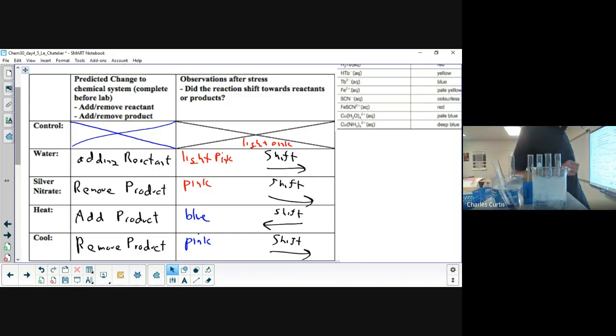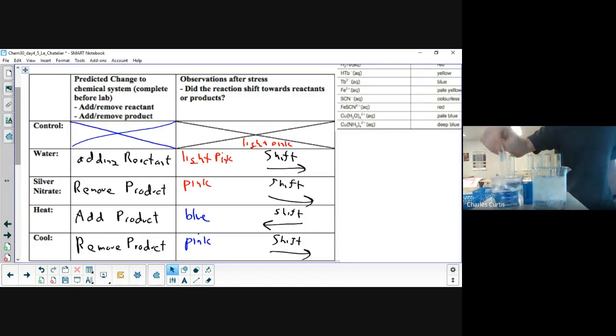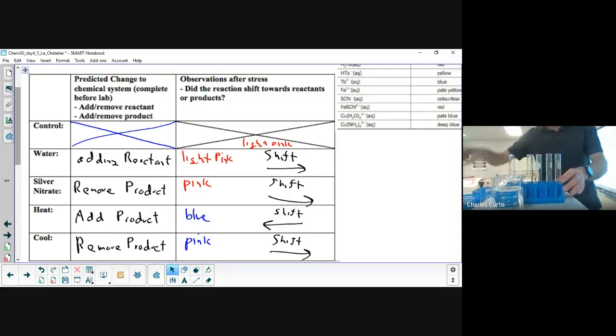Now, while I was writing that down, I threw this test tube back in the hot water. We don't need to record this again, but we're seeing it turn blue. I could go back and forth over and over again, and this would keep changing color. Blue in the hot, turn pink in the cold. Okay. So we're into an equilibrium unit. Equilibrium reactions can go both ways, and there's no limit to how many times. As long as you don't lose the reactant or product, it can potentially shift over and over again. So that's our first experiment. We'll move to the second.